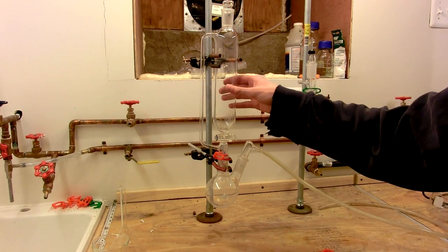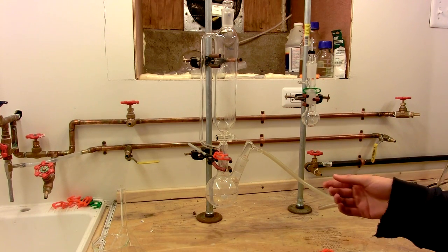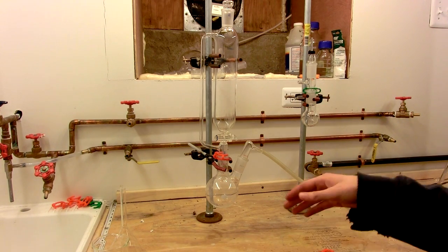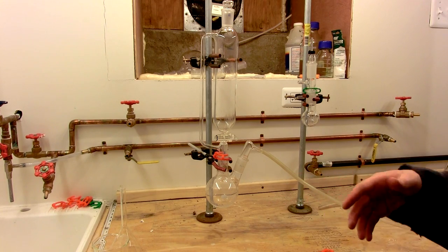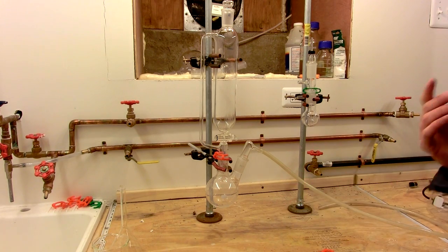Typically, chlorine is generated by the addition of hydrochloric acid to either manganese dioxide, TCCA or trichloroisocyanuric acid, or some other hypochlorite like calcium hypochlorite.